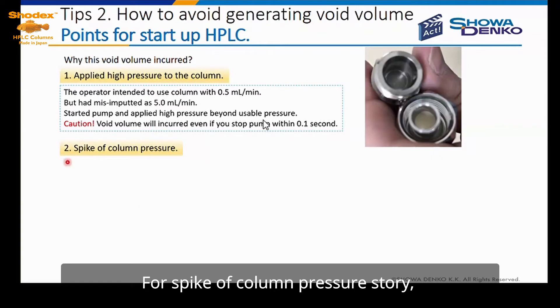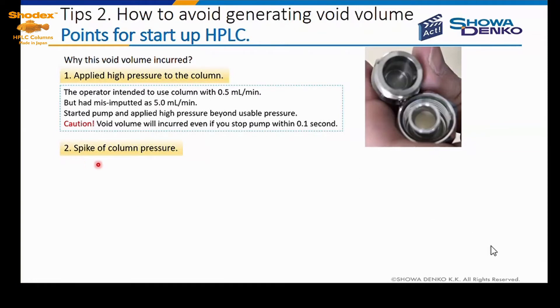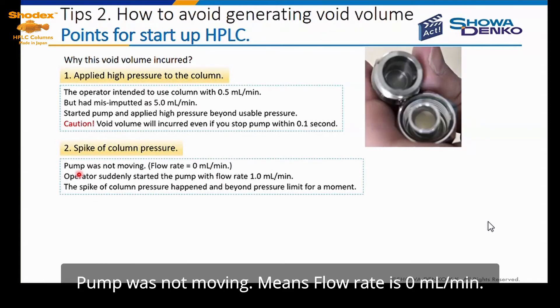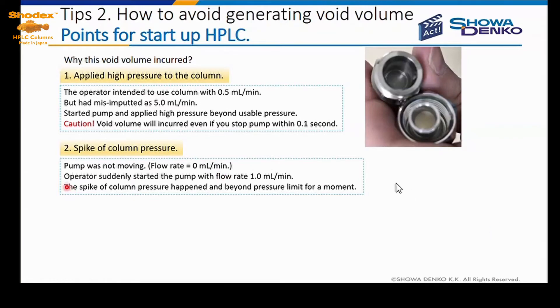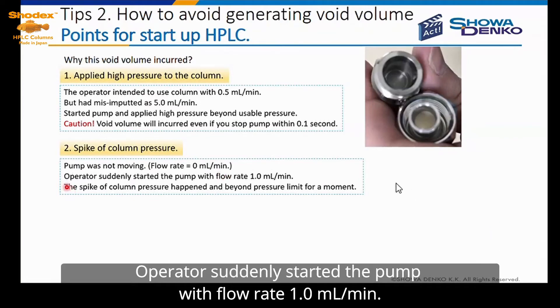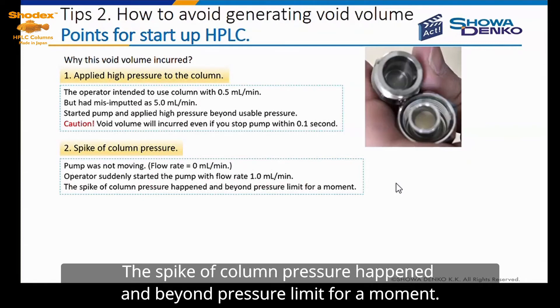For the spikes of column pressure story: a pump was not moving and the flow rate was 0.0 ml per minute. The operator suddenly starts the pump at a flow rate of 1.0 ml per minute, and a spike of column pressure happened, exceeding the pressure limit for a moment.